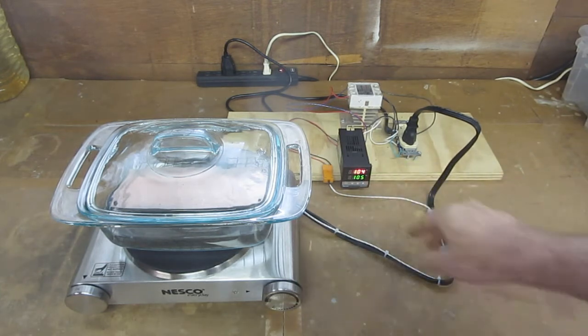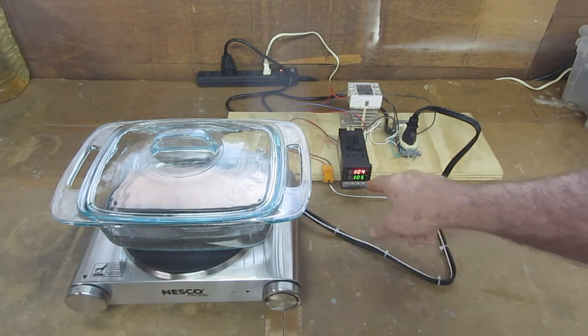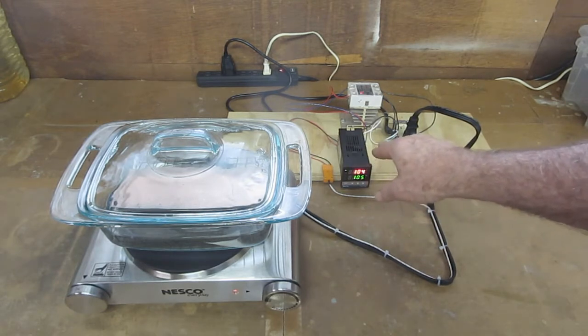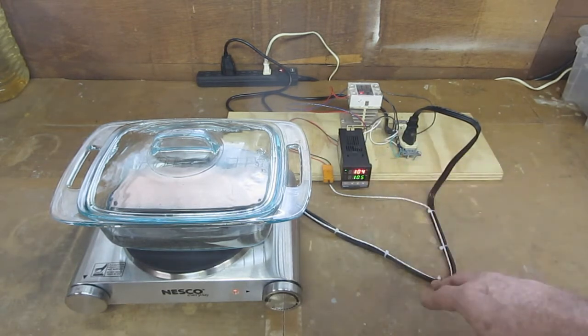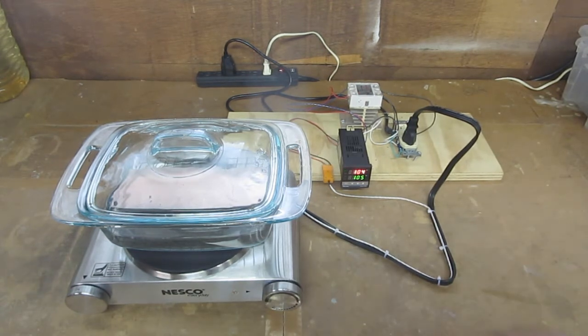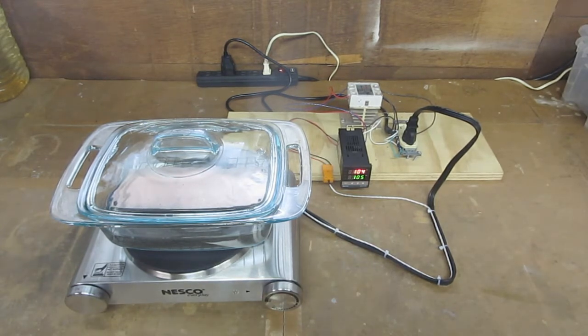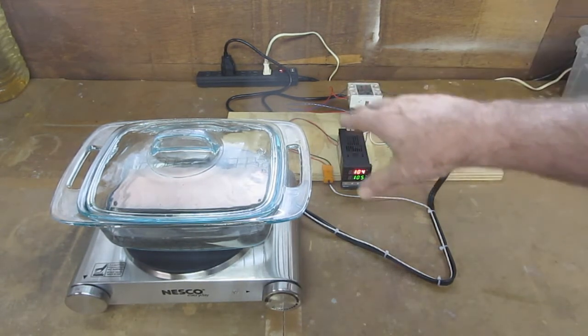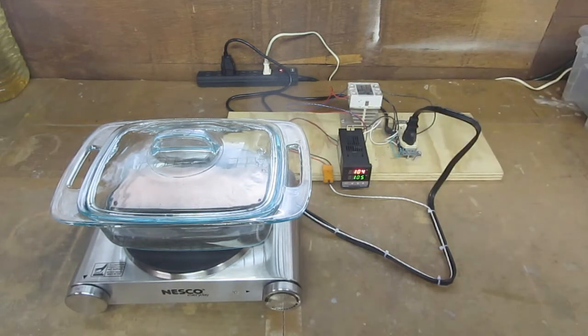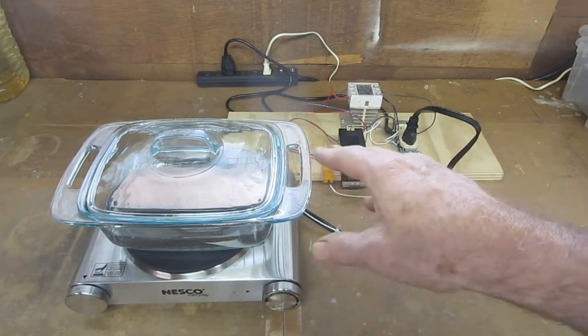The controller reads that information and turns the hot plate on and off as needed to maintain the temperature. These components are just arranged on a piece of plywood here to test the idea and see that it works. All of these components are going to be put inside an enclosure where it will be convenient and safe.